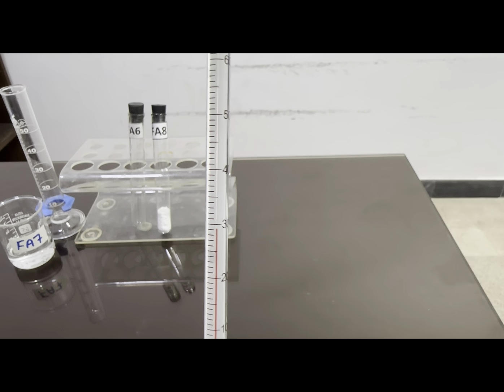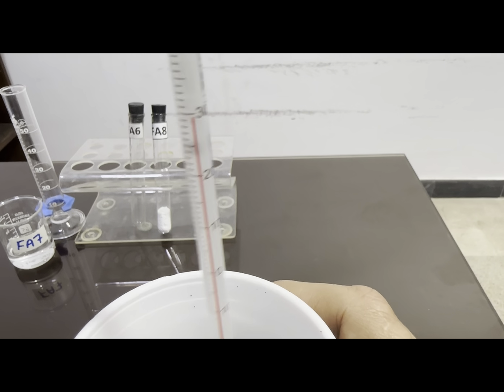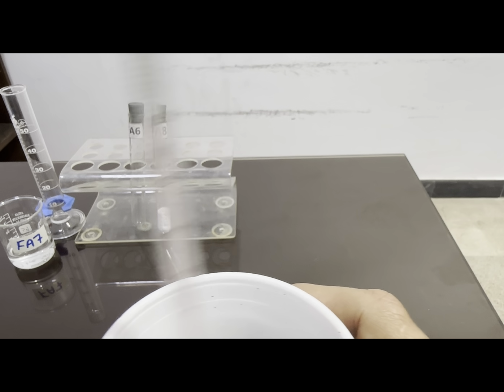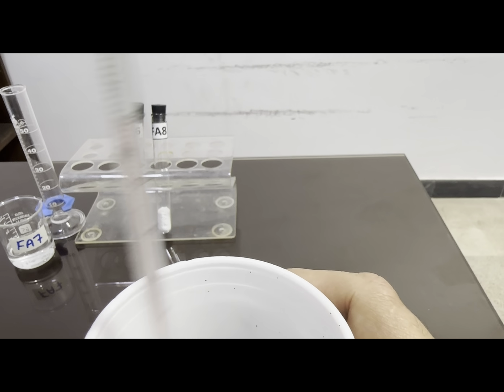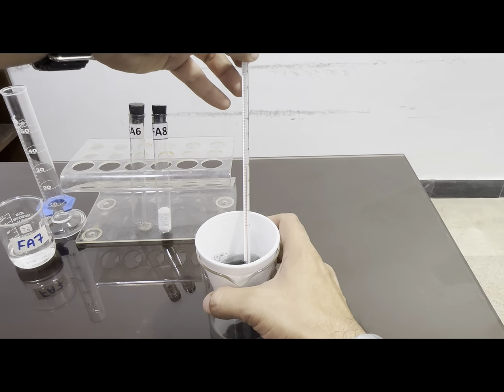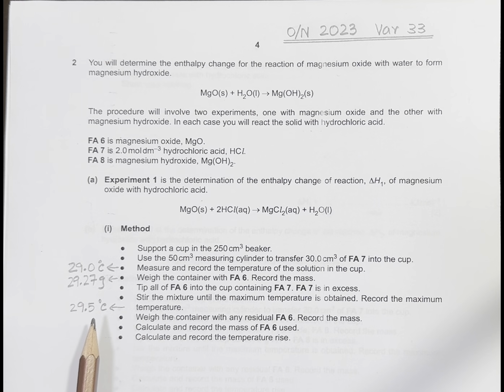So it's 29.5 now. It's 29.5 still. Again, it's not increasing more than 29.5. So just a half degree rise is there. Let's record this observation: the maximum temperature observed is 29.5.